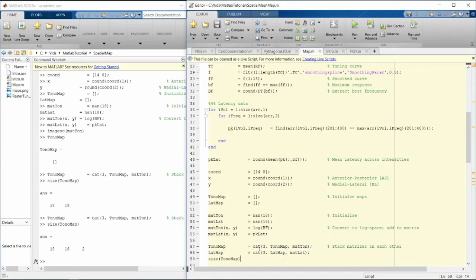You do the exact same thing for all cells in your population. You stack them on top of each other. Of course, the recording coordinates will vary, and at the end you simply average over the third dimension in order to get your average feature map.